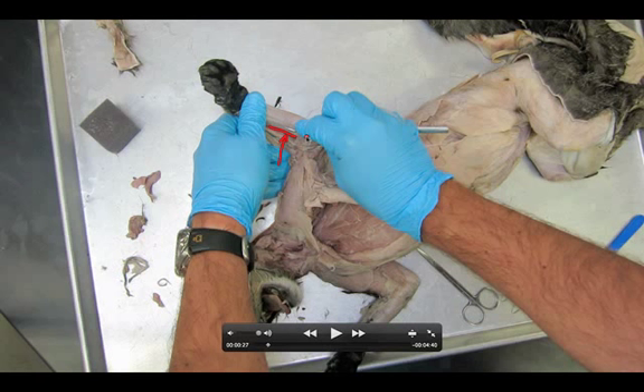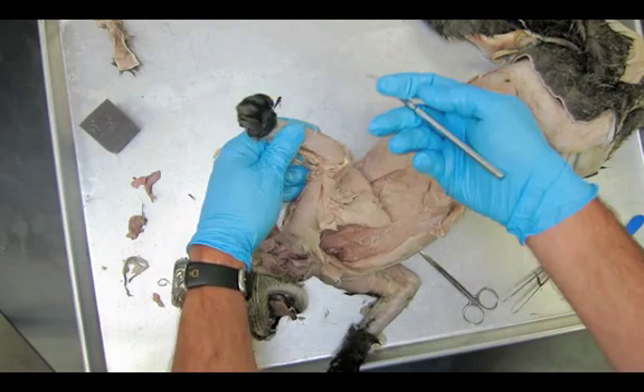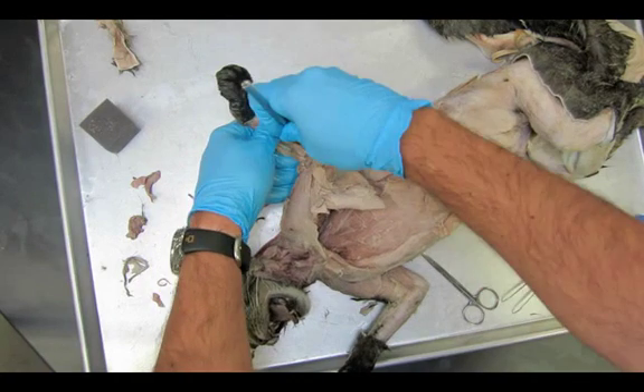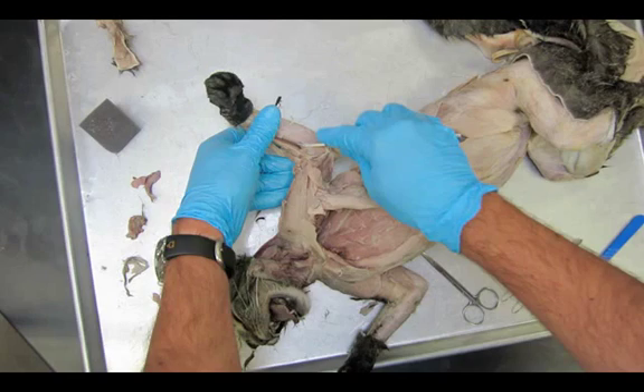The first muscle we'll identify is the pronator teres. Notice its shape — it's kind of fat and thicker at this end, and then it turns into a narrow strip down at the bottom. You do not need to get underneath that muscle like you did with all the others, so don't worry about getting underneath it.